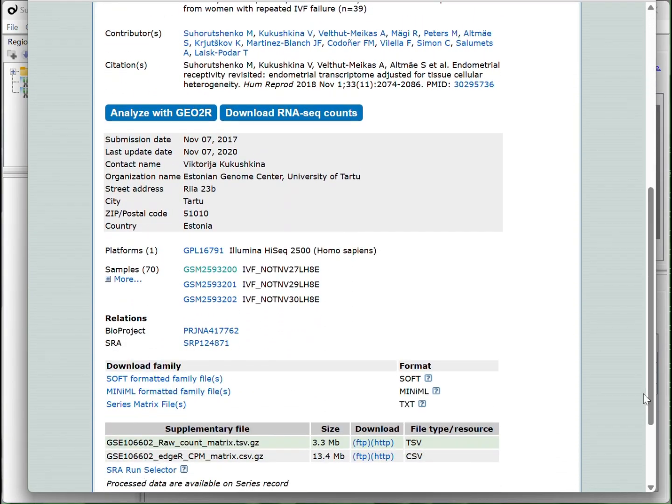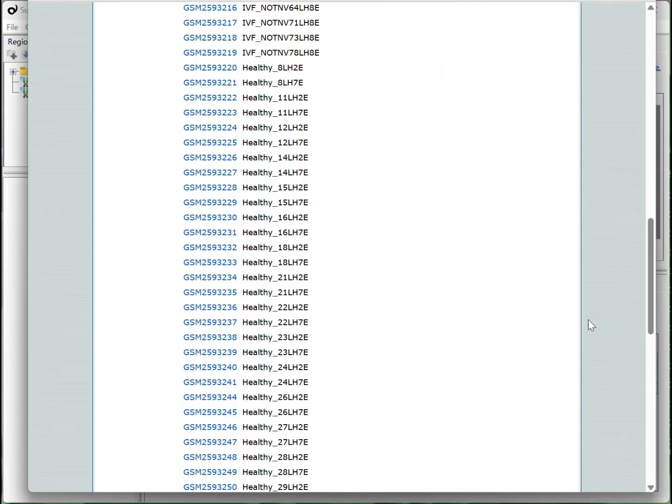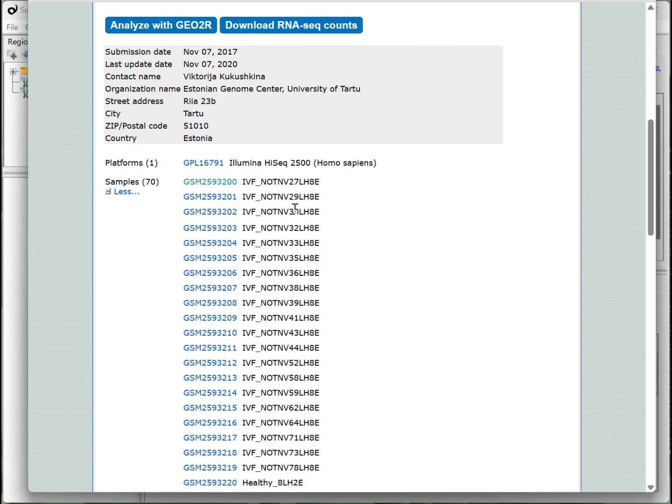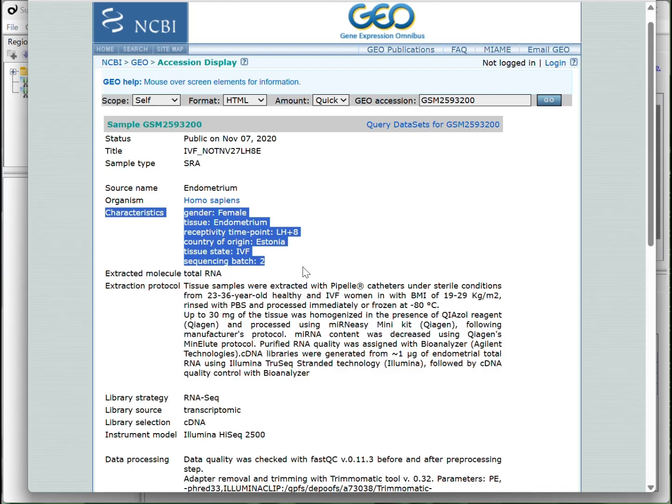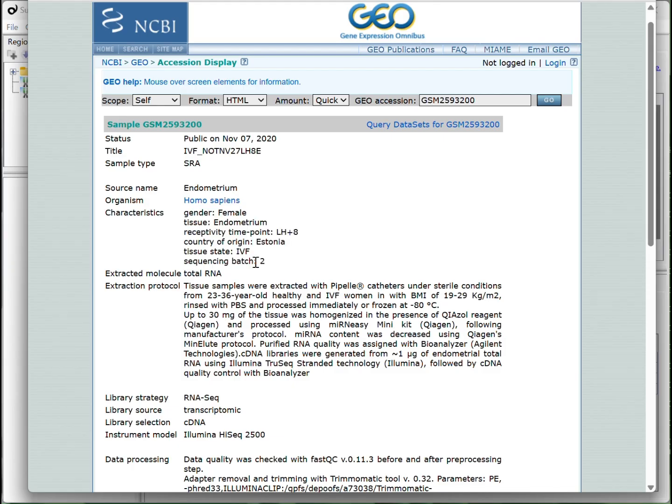You can access a GSM sample record from a GEO series page. The characteristic field stores multiple experimental parameters, each with a title and value. But it might be a bit hard to handle if you don't have coding skills.